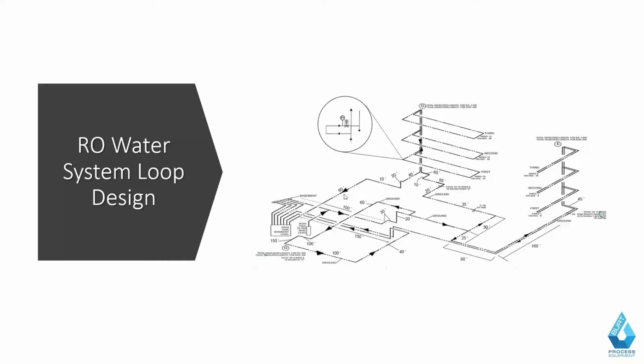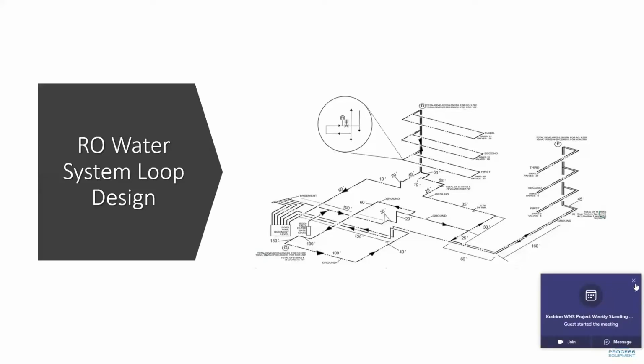And you control pressure on the main loop back at the storage tank, and you individually control the pressures, as you can kind of see here, off of every one of these secondary loops. This gives you essentially a uniform pressure at each one of the loops, and it also allows you to then change the loop piping between the different levels. So say you only have a very small lab space on this level, but much more lab on that level. These can have different size loops at that point.